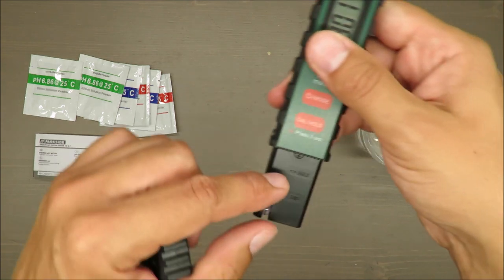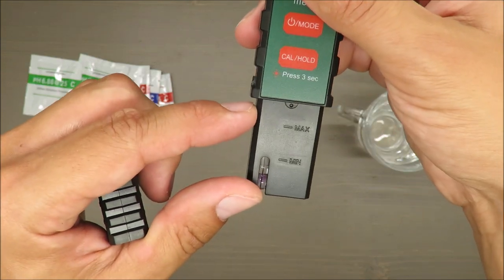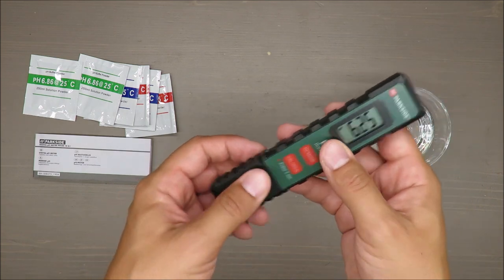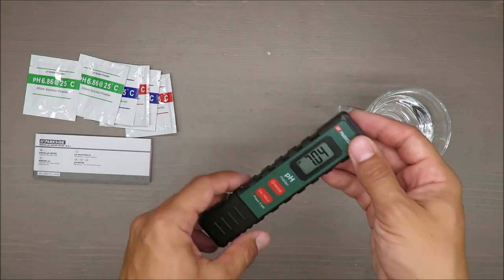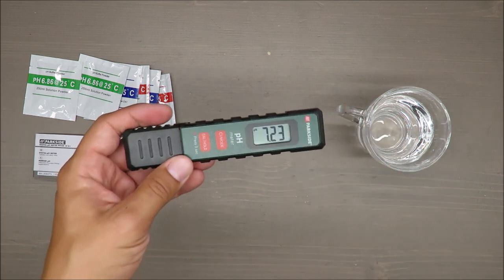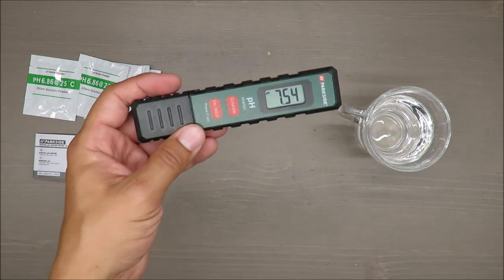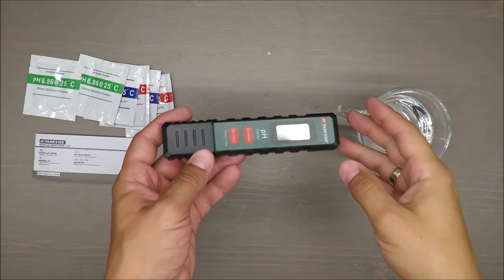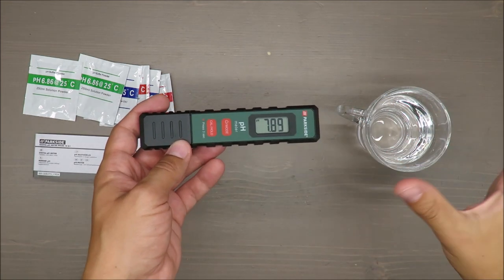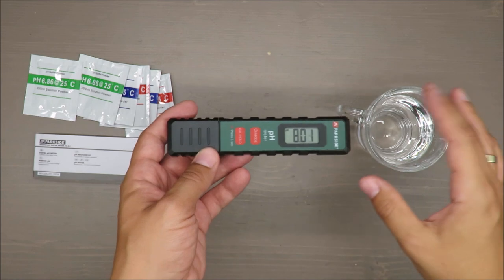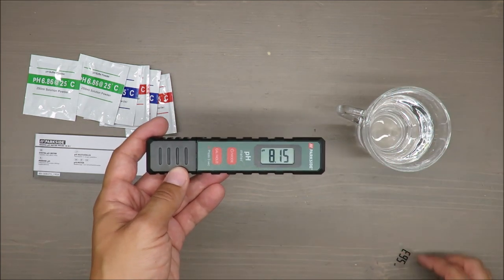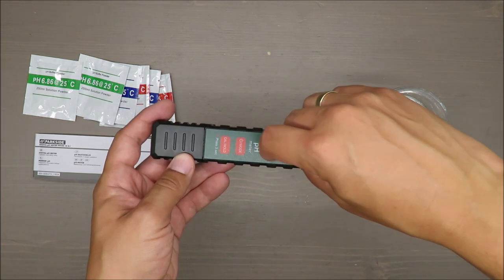What else? Minimum maximum depth, because you need to put it into a solution or into a medium that you want to measure. For those of you who are not aware about chemistry, for instance regular water from the tap should have pH like 8-something.